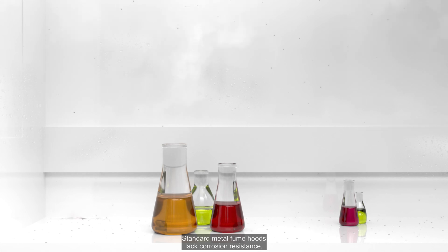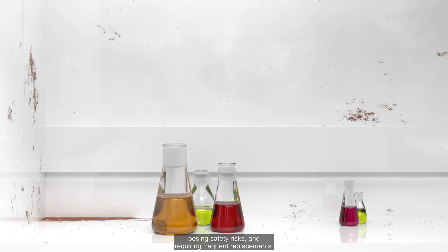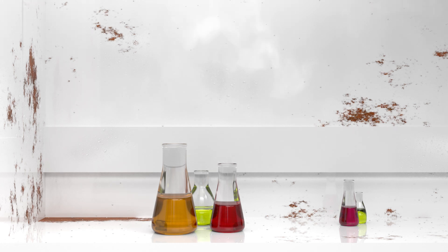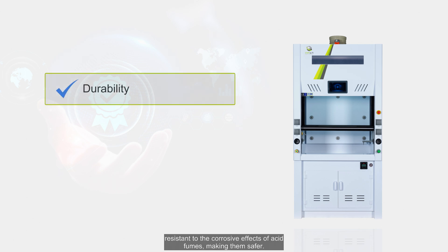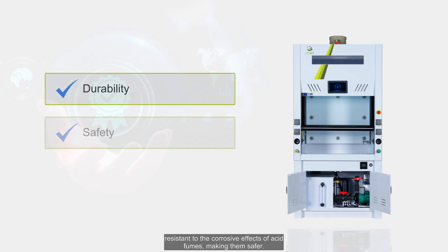Standard metal fume hoods lack corrosion resistance, posing safety risks and requiring frequent replacements. Top Air Systems suggests using polypropylene fume hoods, which are highly resistant to the corrosive effects of acid fumes, making them safer.